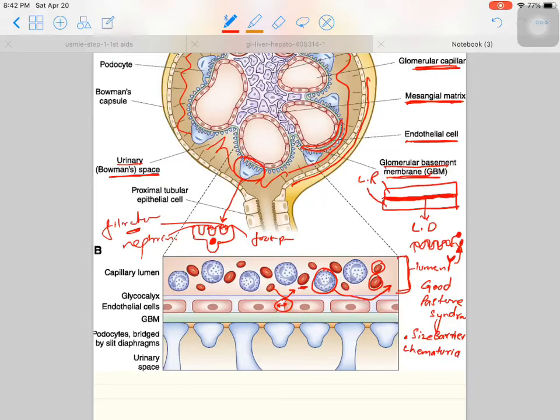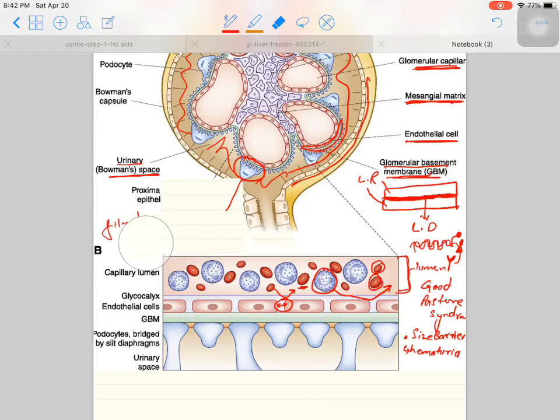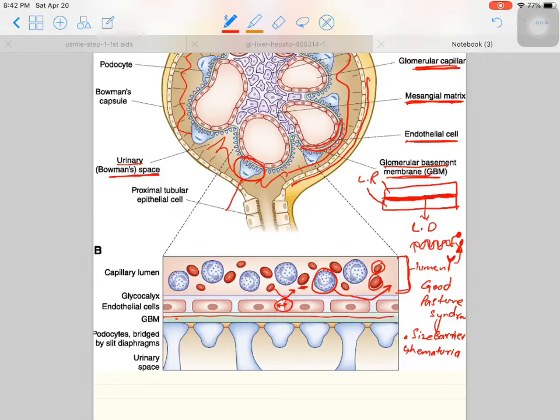The layer of basement membrane also has very small pores, which allow very fine molecules. For example, glucose and albumin can pass through this membrane. Glucose can easily filter, but albumin, although it is a small molecule, goes back to circulation and is not filtered. This is because of the charge barrier at the level of the foot processes.